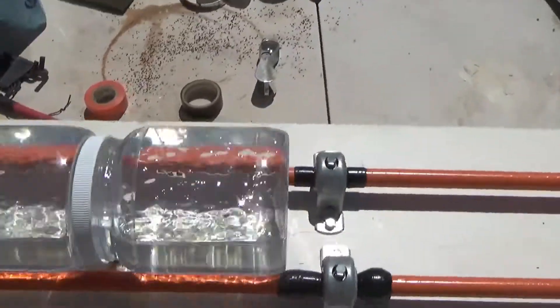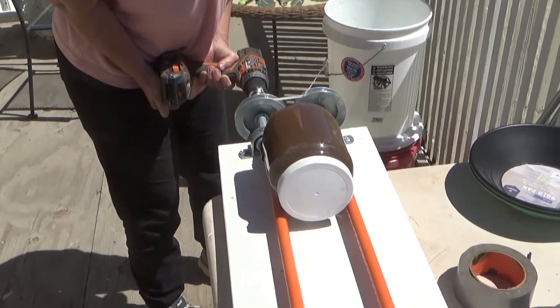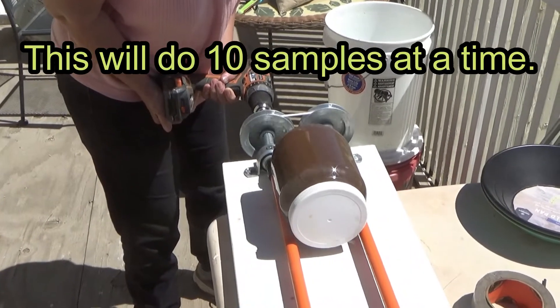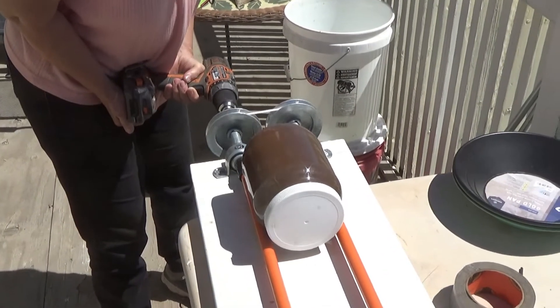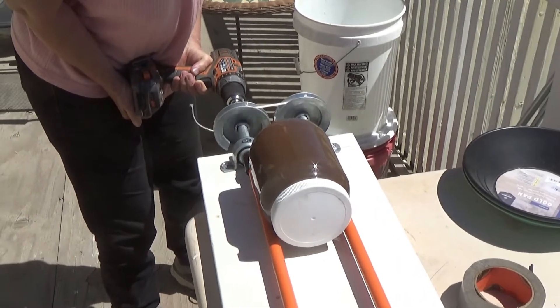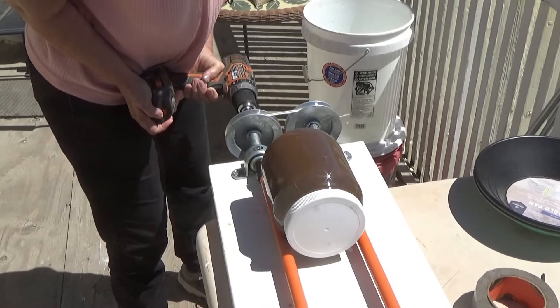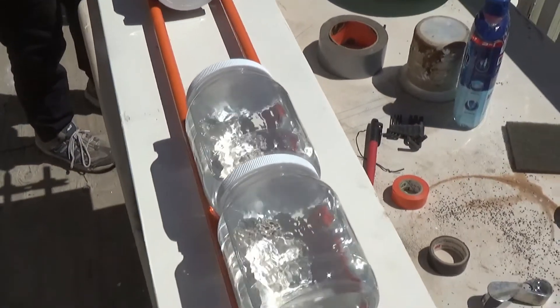What that does is it creates an agitation leach that's very small, very self-contained, so you can do this to test all the parameters: the pH adjustment, the speed of reaction, how much of your lixivant gets consumed during the process — all the sort of things you need for a bigger process.